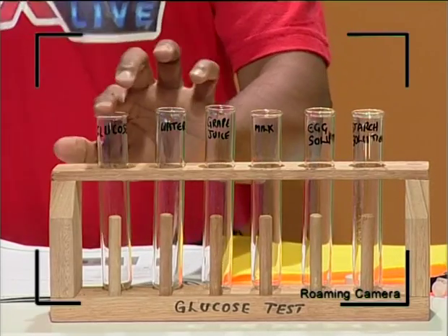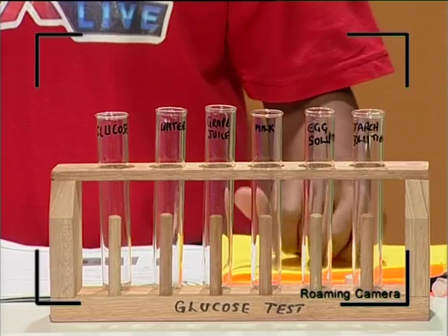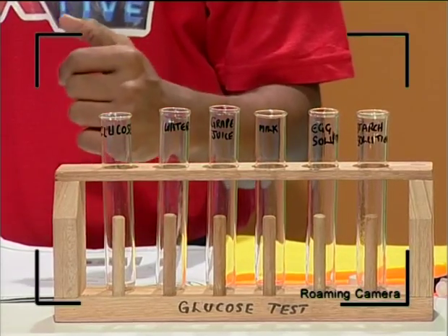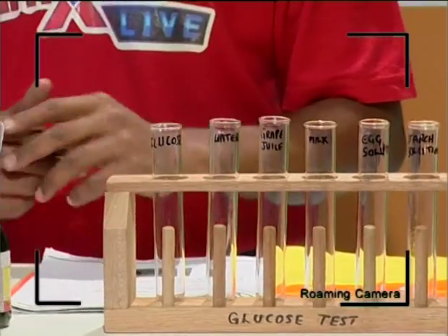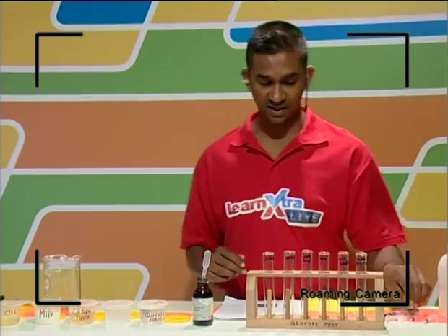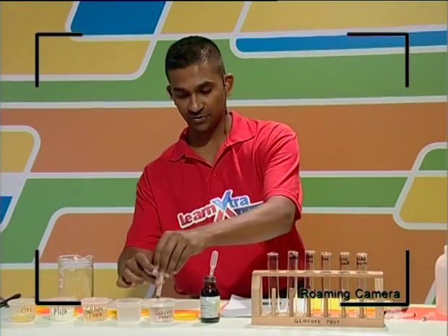And we call these the positive control and the negative control. The reason why we have these is because in order for us to know what the color change is of a substance that contains glucose, we would need to have glucose in that series of experiments. So we have a positive control as well as a negative control, which is water.